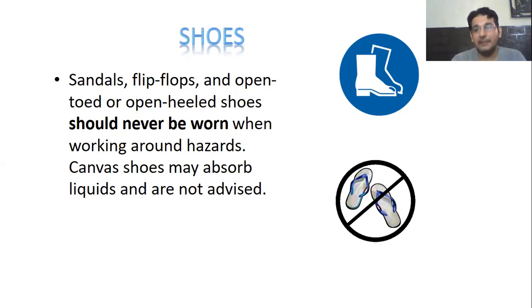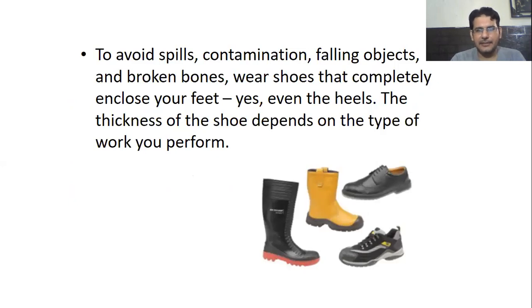Closed shoes are normally recommended in the laboratory — not open ones, because open shoes increase exposure. To avoid spills, contamination, falling objects and injury, wear shoes that completely enclose your feet, including the heels. The thickness of the shoe depends on the type of work you are going to perform. As I mentioned at the very start, we have to calculate the risk initially — what kind of experiments we are going to do — and accordingly put on all the personal protective equipment.